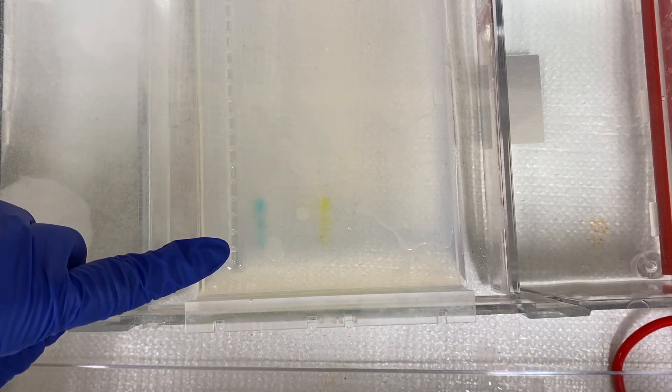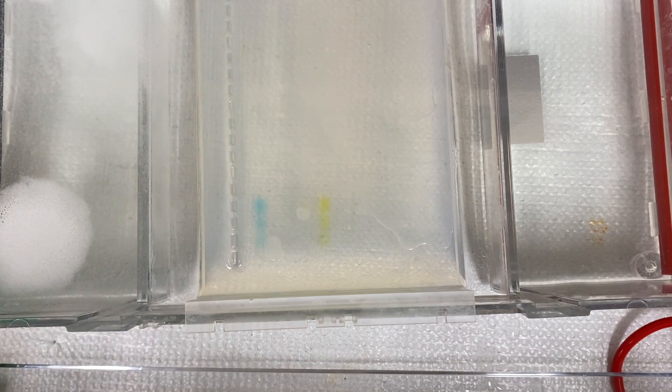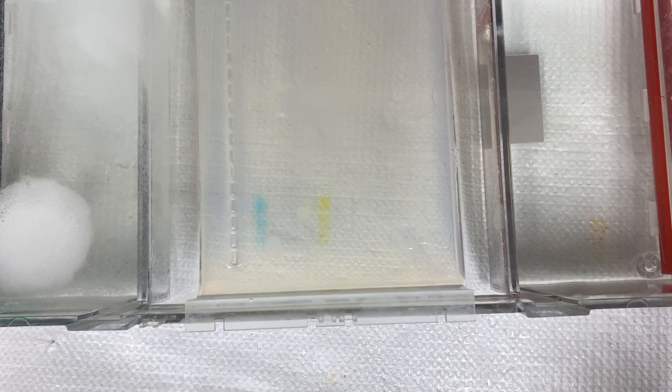Once this process was complete, I saw these really nice bands in the gel. There are actually two bands because certain dyes give rise to two components with different electrophoretic mobilities. They don't actually interfere with our ability to read the data though, so it's not really something to worry about.